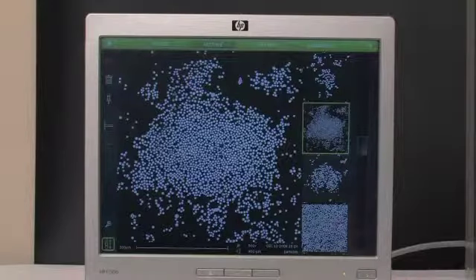Wow, that's exciting. Now I see you've queued up an image here. Can you tell us a little bit about it? Sure. So this is a scanning electron image of several small particles. Now, most of these particles are about a micron in diameter. There are two things to pay attention to.